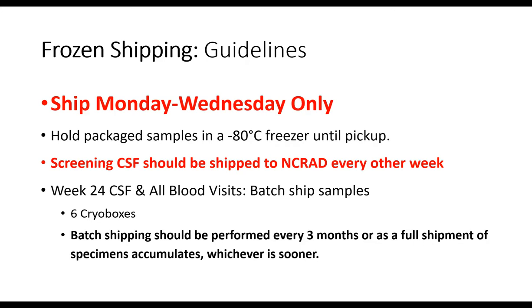The screening CSF should be held no longer than shipped every other week. So if you are collecting the screening CSF this week and you have no other participants scheduled this week or next week, just go ahead and right away ship that to us at NCRAD, because we have to get that sent out for the assays to be done, for the screening evaluation to be done. But if you're going to see a subject this week and another one in a couple days, you can go ahead and hold on and send those together, but the most we want them to be held is every other week.